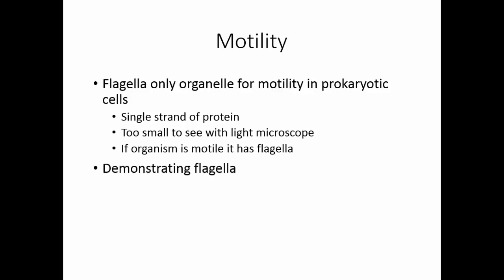There are three ways to demonstrate flagella. One is using a flagellar stain. This is helpful if you need to know the number and arrangement of flagella. Usually this is not that important. A flagellar stain is very demanding and takes a lot of time to do.